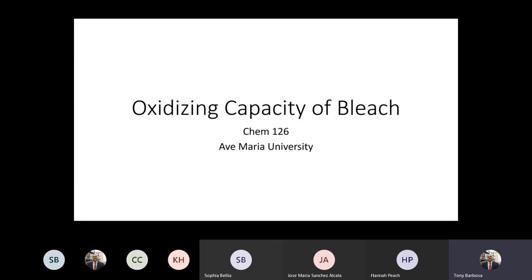Alrighty, what are we doing today? So we are going to be covering the oxidizing capacity of bleach. I'm going to walk through what you would have done from the lab, and I'll give you each some data. You'll each be assigned a certain amount of data, and once you're assigned the data, you'll be able to essentially crunch the numbers.